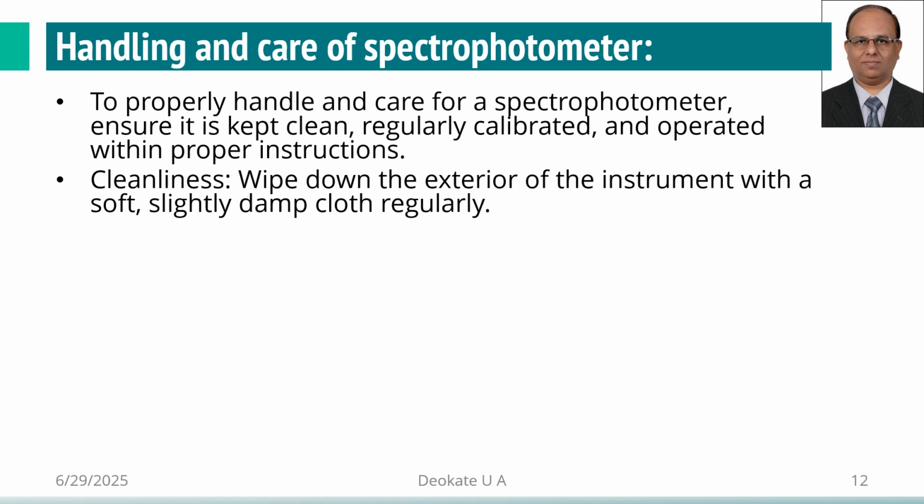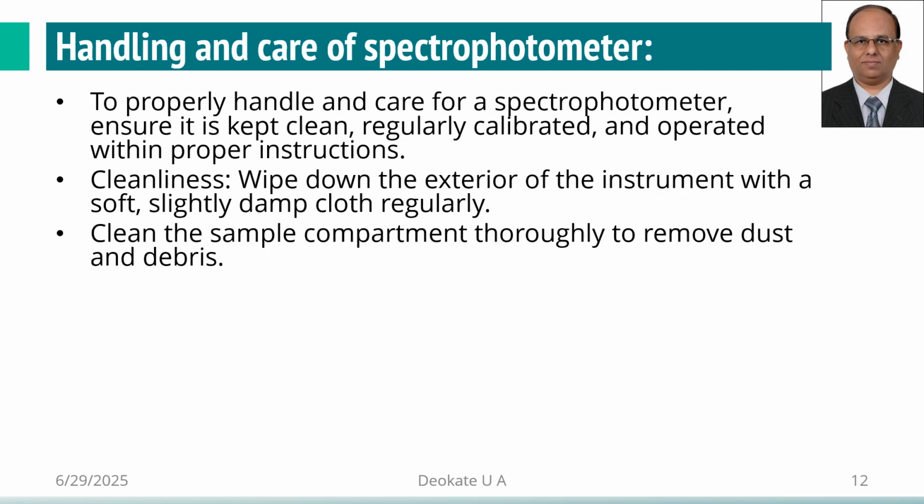Read the standard operating procedure before you start using the instrument. Cleanliness: wipe down the exterior of the instrument regularly with a soft, slightly damp cloth. Clean the instrument's external surfaces before you start using it and after use also. Then you proceed with your further work.